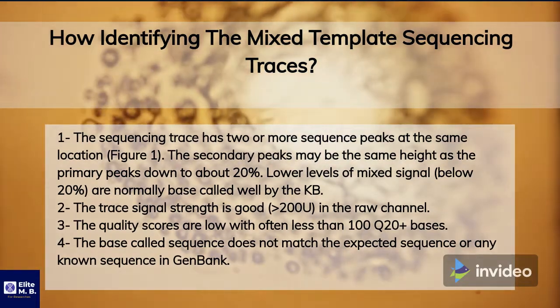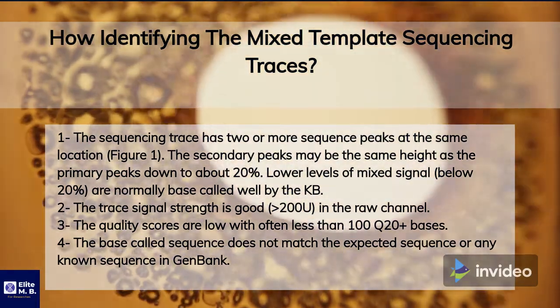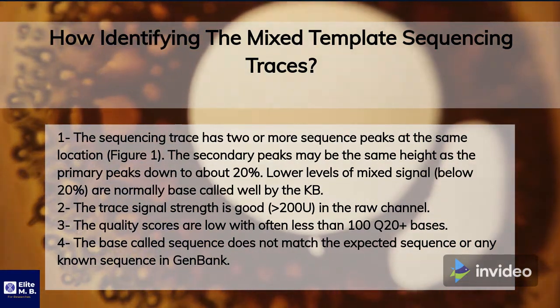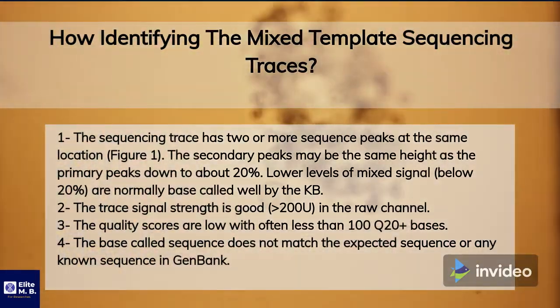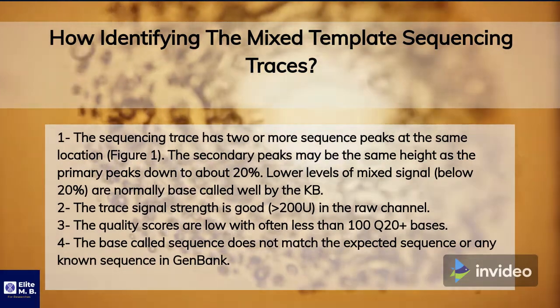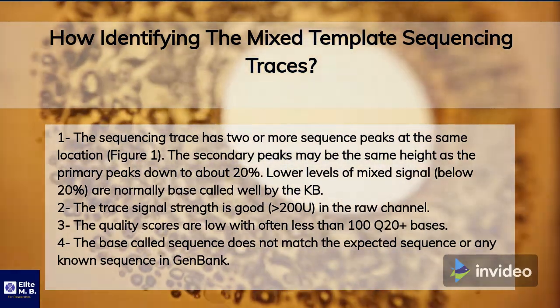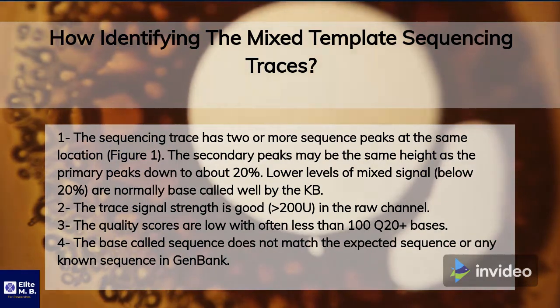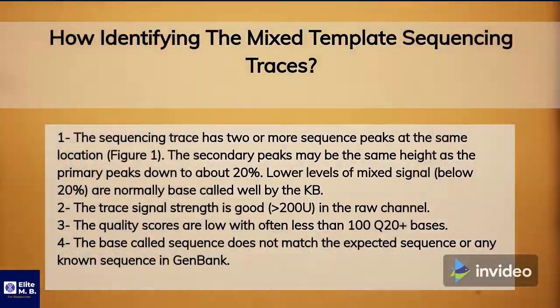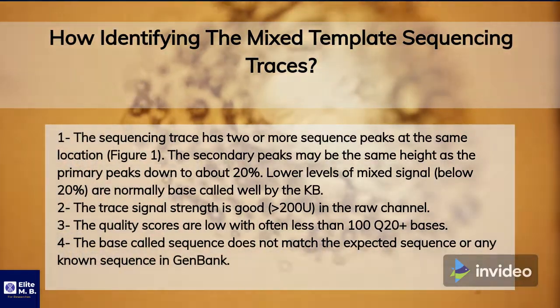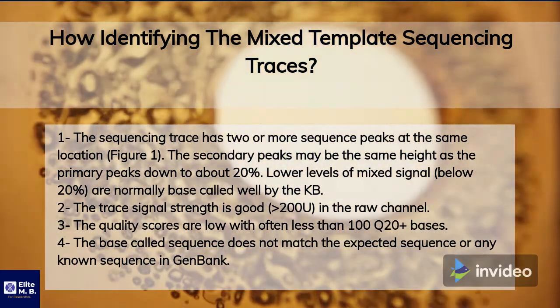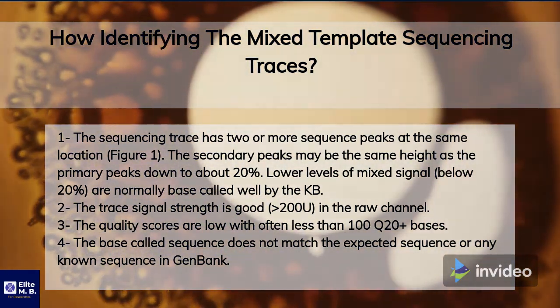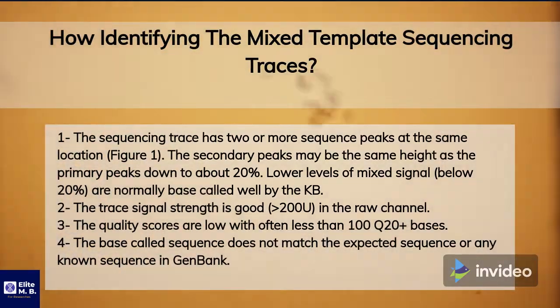Lower levels of mixed signal, below 20%, are normally base called well by the KB basecaller. The trace signal strength is good, greater than 200 U in the raw channel. The quality scores are low, with often less than 100 Q20 plus bases. The base call sequence does not match the expected sequence or any known sequence in GenBank.